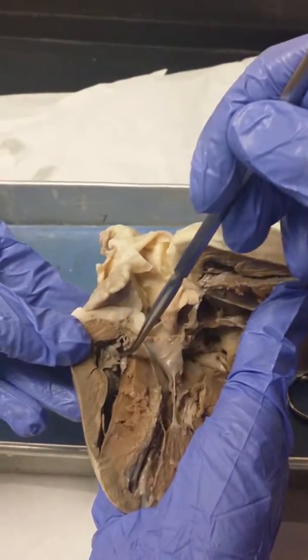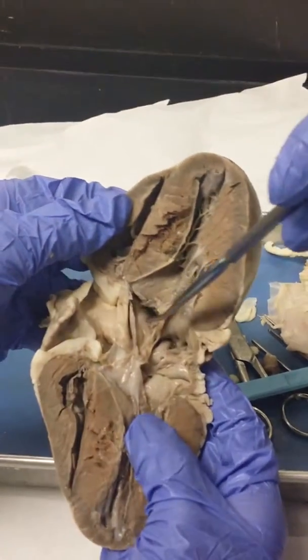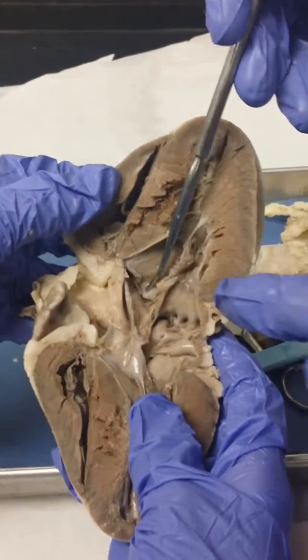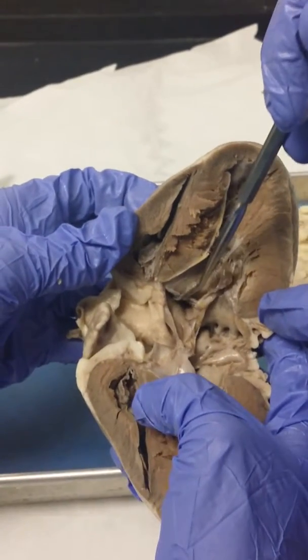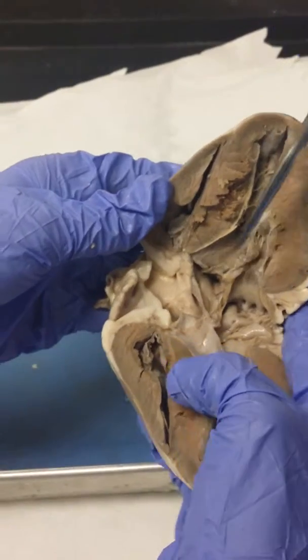Your tricuspid valve — on the right side it's your tricuspid valve, you can't really see it. And this would be your bicuspid valve on the left side. And right here, this is your aortic semilunar valve.